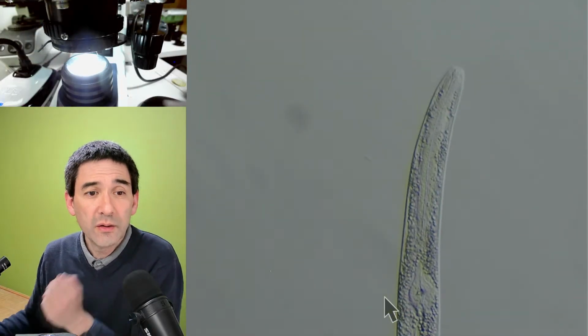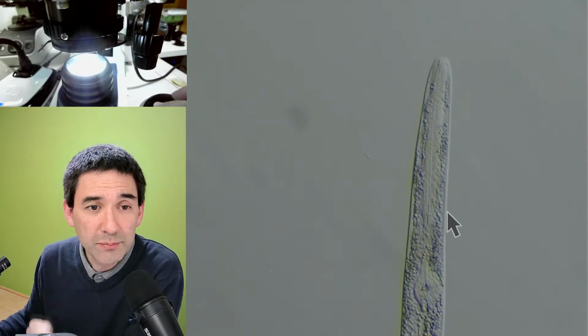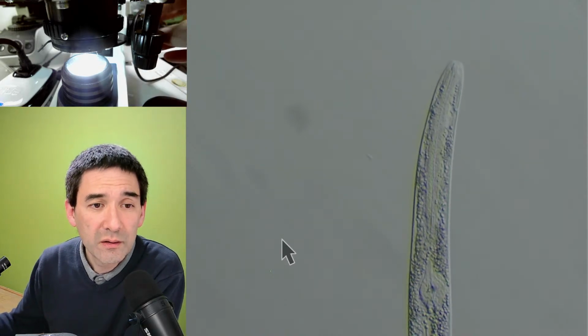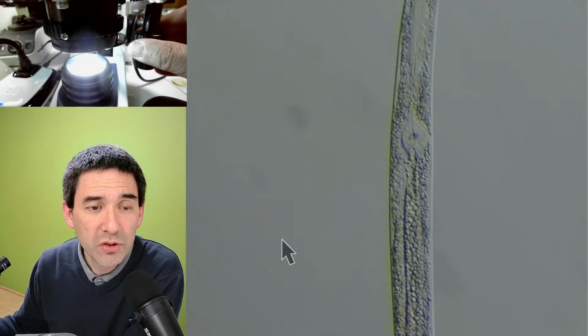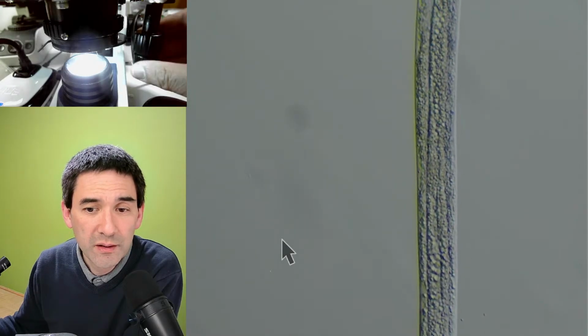Now you actually see that the light is coming from the right side. It's bright here, and over here it's dark. It looks quite okay. It's a little bit limited in its movement. That's good because it's kind of sandwiched a little bit between.